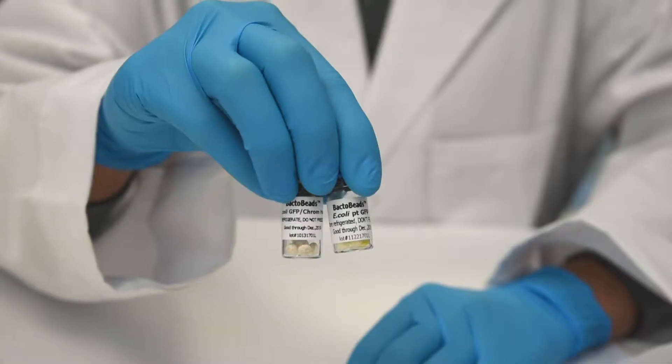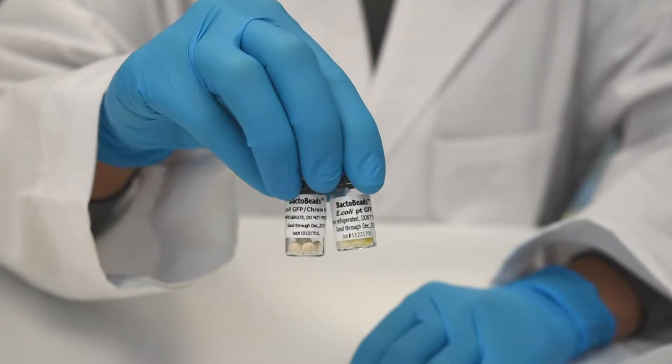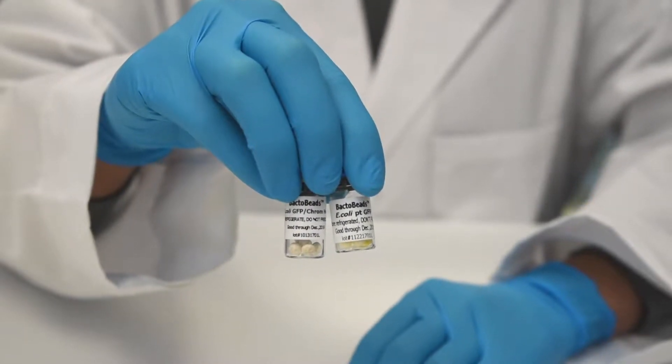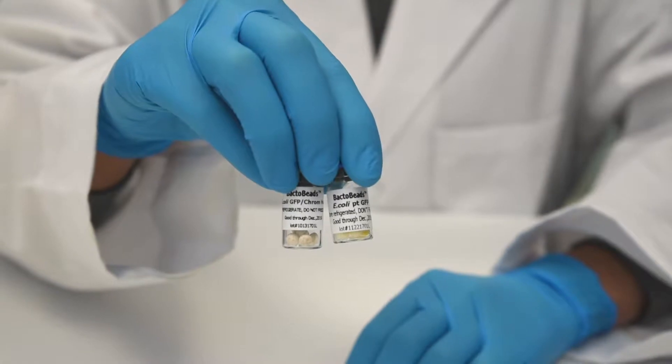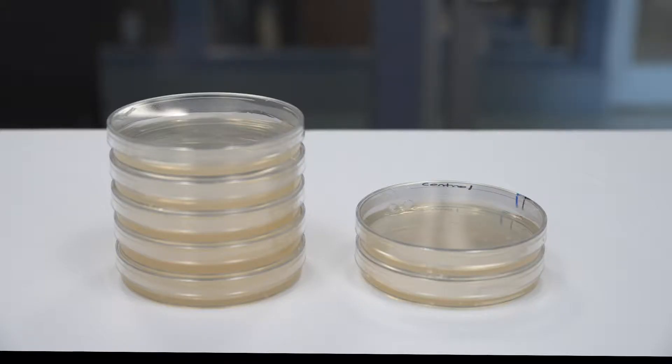For this prep, you will need vials of E. coli GFP Host and E. coli PT GFP Bacto Beads, 5 large petri plates containing LB agar, and 2 large control plates containing LB agar plus ampicillin and IPTG.